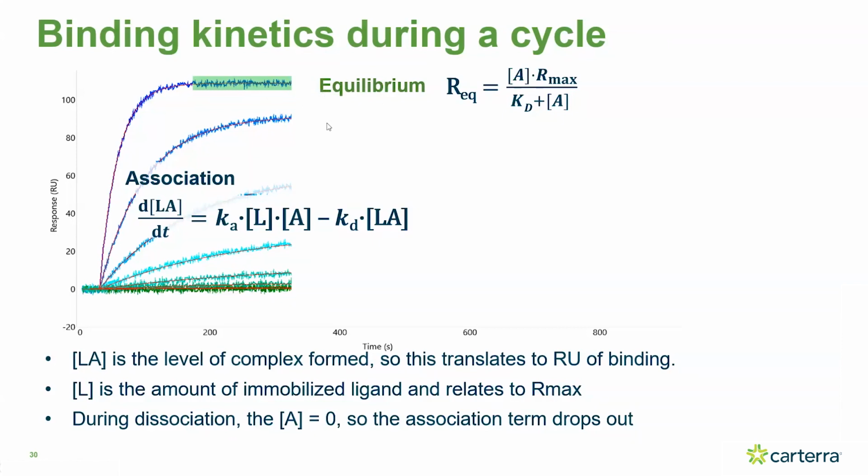I mean, obviously both the on rate and the off rate affect it, but typically the biggest contributor is the off rate. And the equilibrium value itself can actually be determined not kinetically. So it can be described by this equation where you can use the KD term, and it's really an affinity-based thing. It's the time to equilibrium that's affected by the kinetics.